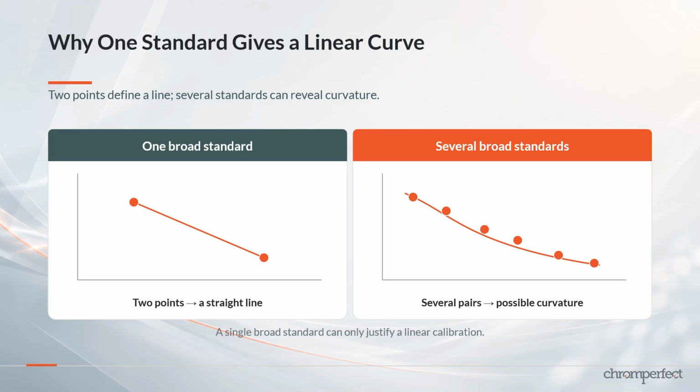The combined data may then support a nonlinear calibration curve. Replicate analyses can also provide repeated pairs of points, improving the statistical basis without increasing the number of distinct molecular weights represented. The Hamilec method is attractive because it requires only two independently measured molecular weight averages rather than a complete distribution table.